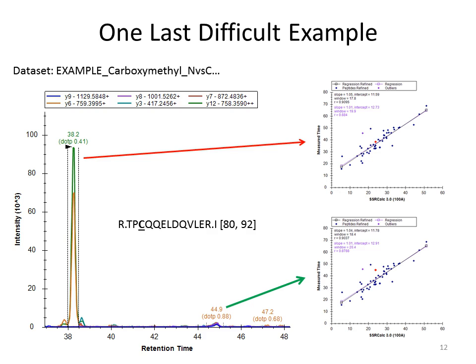And so actually here's a good example too. I mentioned that this SSRCalc is a hydrophobicity predictor. This 100 angstrom is based on the pore size of the columns you would use, and so you can also put in 300 angstroms. Those are two of the provided settings. But the problem with it is that whatever your peptide sequence is, it's going to calculate a value. It does not take into account modifications.